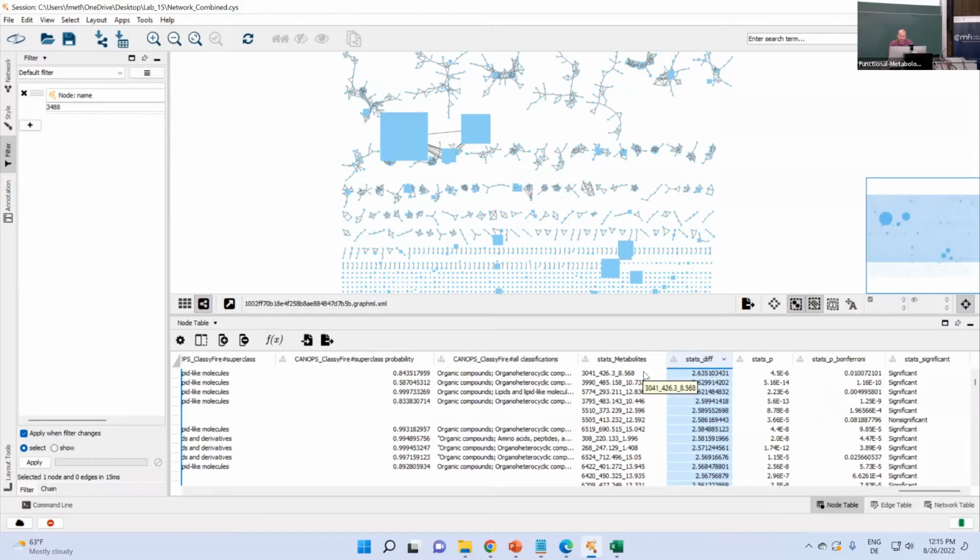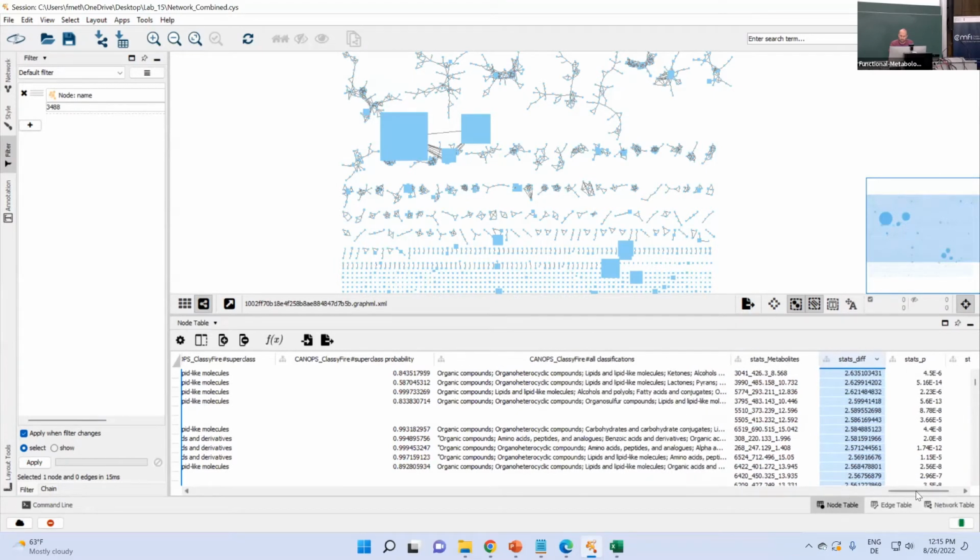And then what was the highest number, the strongest upregulated or produced compound in the algae, right? And if it was negative, then it was lower. So that was perhaps a suppressed feature in our DOM background. Okay. So now I sorted this simply by clicking at the header.